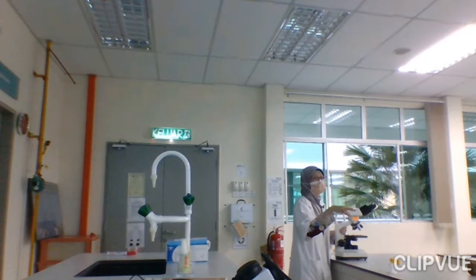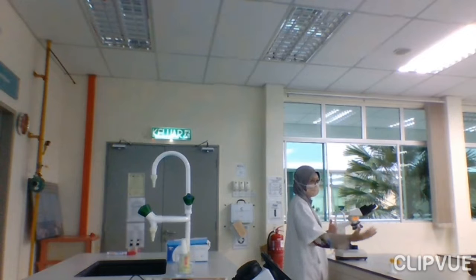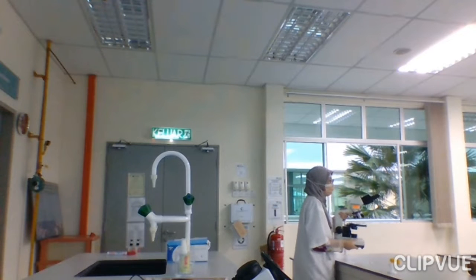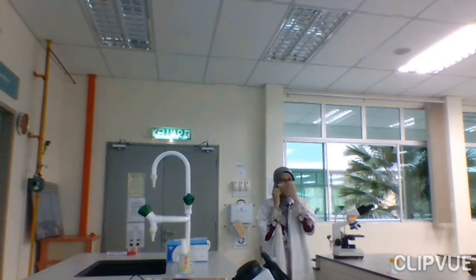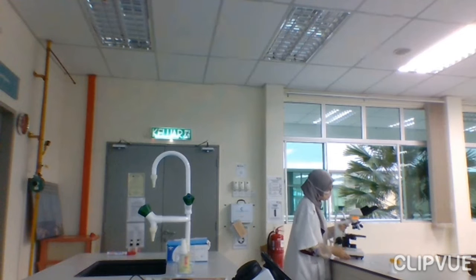And if it's on the bench, don't drag the microscopes. If you want to change the position of the microscope from one to another, make sure that you lift it and change the position. Don't drag. So I'm going to carry this onto my bench.